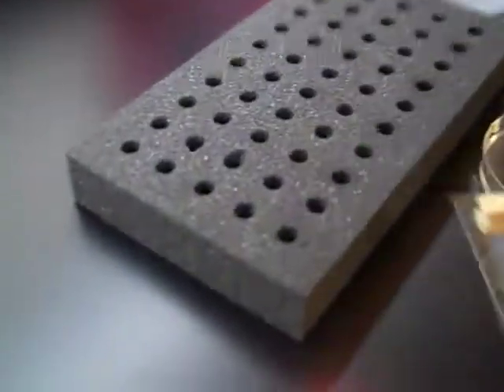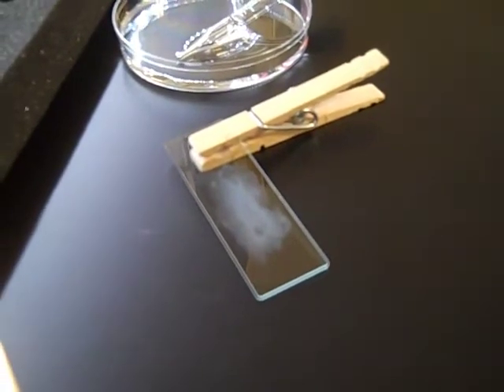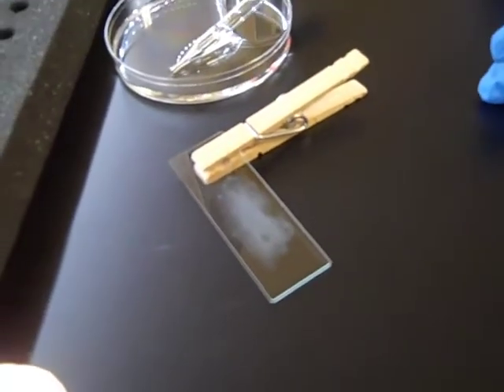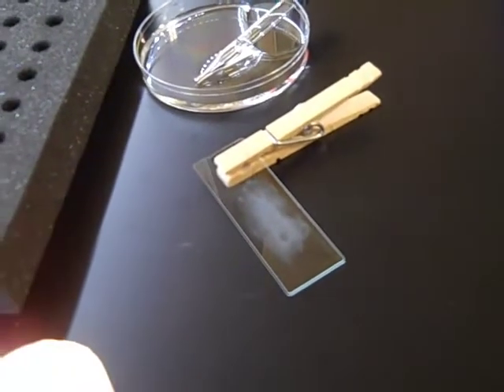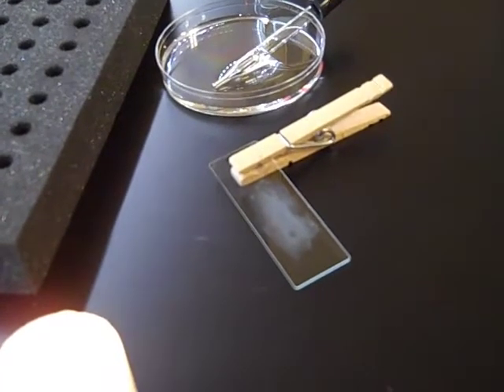Then you need to allow the slide to cool before proceeding to the gram staining procedures. Do not pass the slide through the flame while it's still wet. If you add too much heat, this can cause the bacteria to aerosolize. So make sure that you let it air dry for a sufficient amount of time before heat fixing.